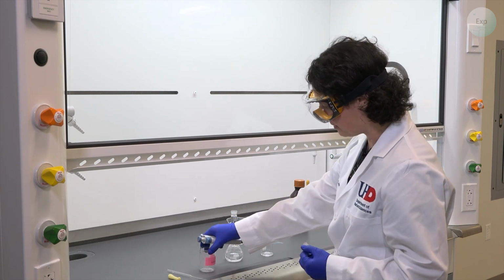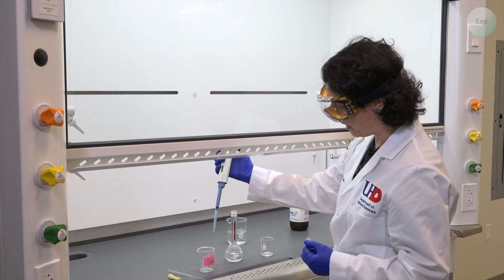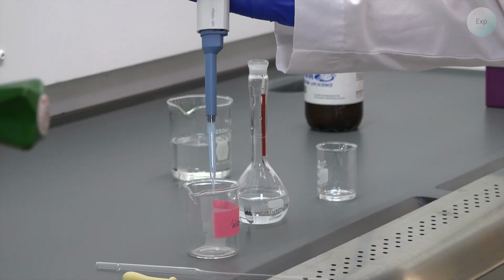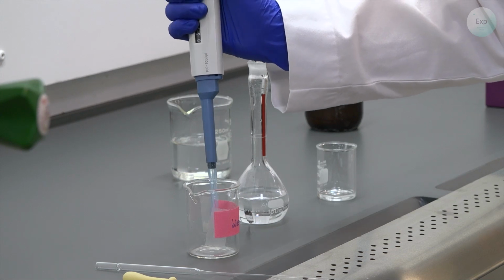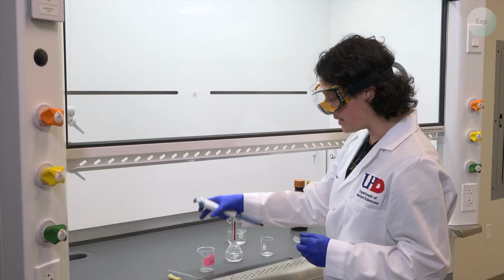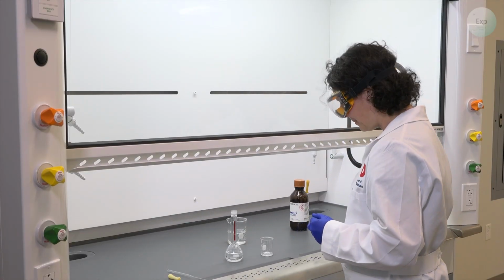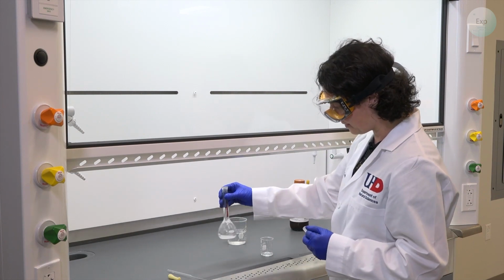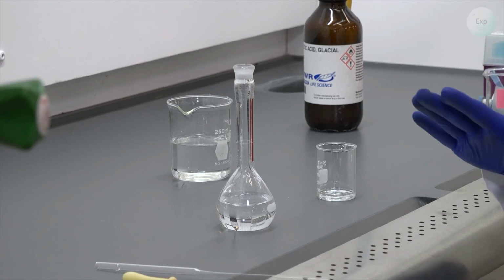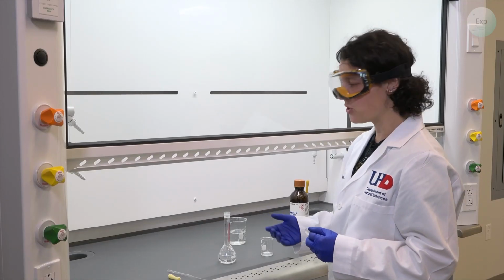For that, we're going to use the second button that's on our micropipette. Once our tip of the micropipette is above the waste container, we push the button and we slide it out. And now we can set both our waste container and the micropipette aside. The solute is in our volumetric flask. We have the right amount of solute. Next, we need to get to the desired volume, which is 100 milliliters.